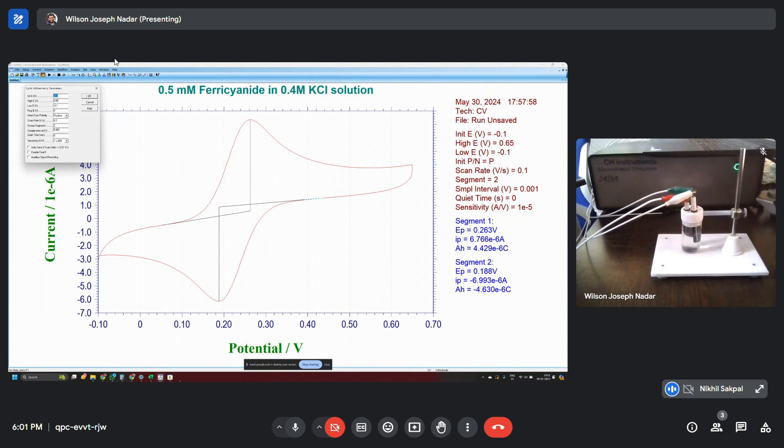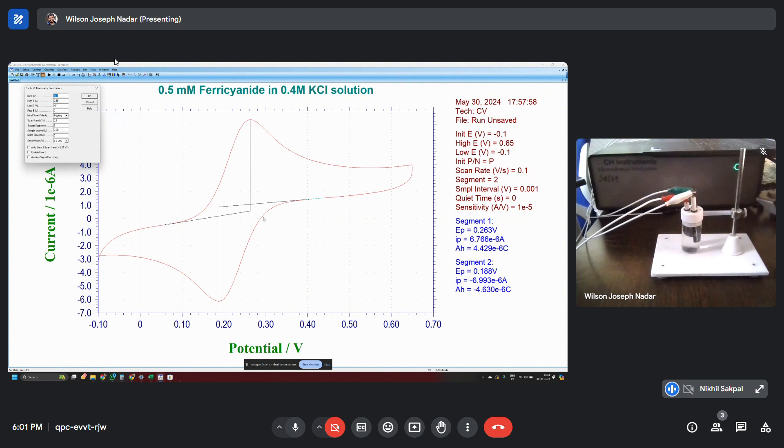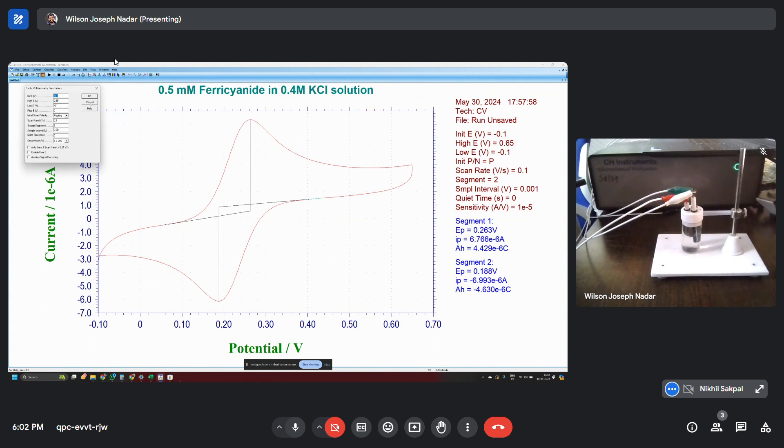So that gives the advantage of no attention being required once you set the whole program and then you can simply run. This is now already run CV with the help of a normal technique definition and the parameter definition respectively. But now we will try to run a macro program.